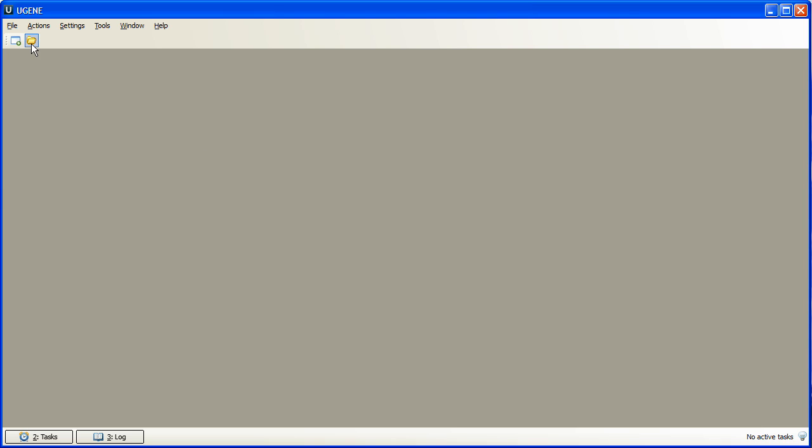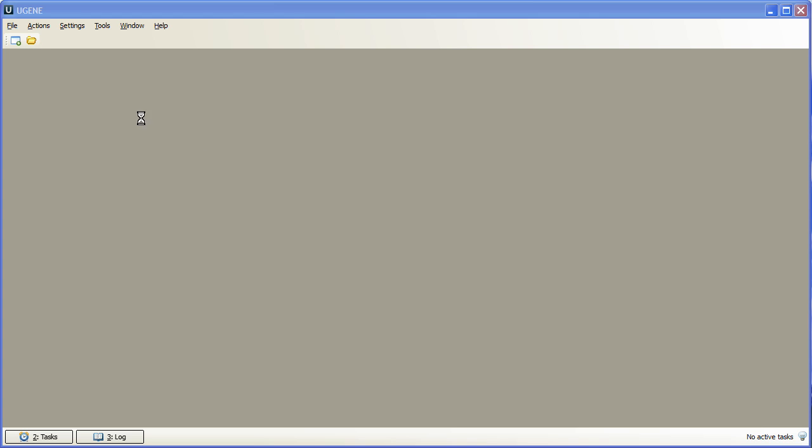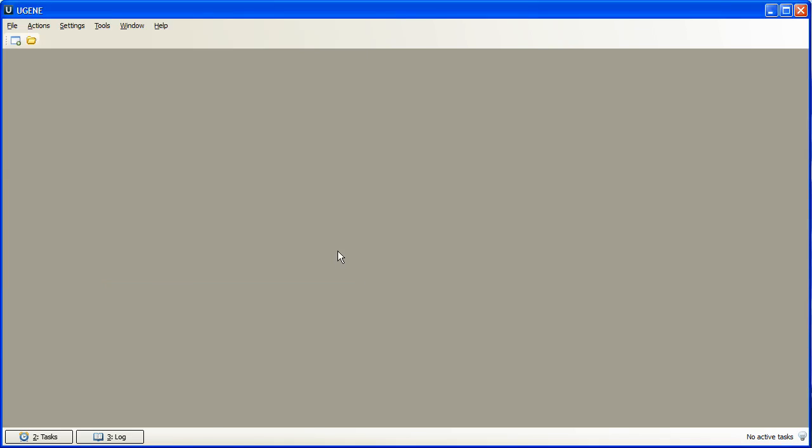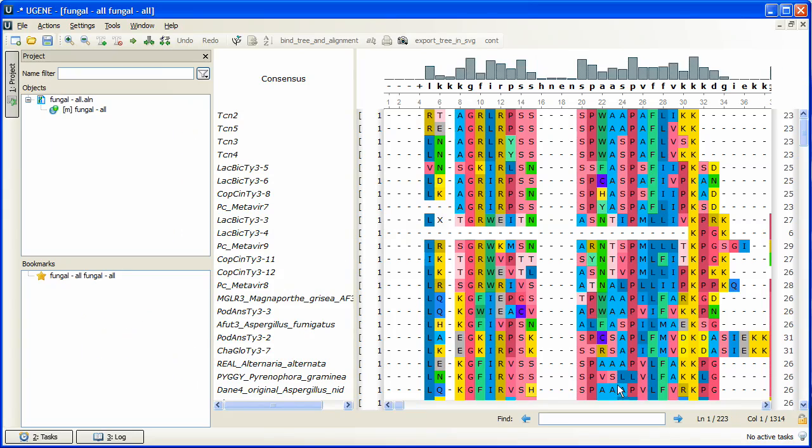Let's open an alignment. This alignment contains, as we see, 223 sequences of length up to 1300 symbols.